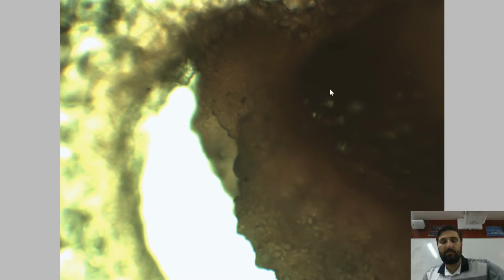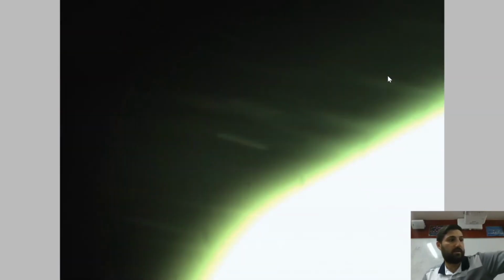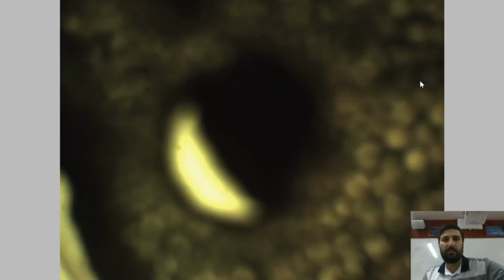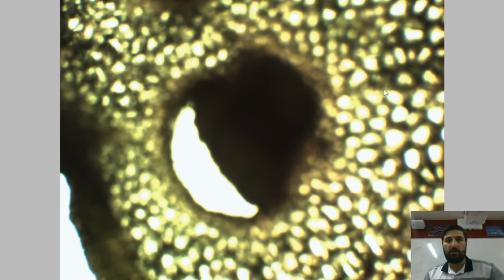Okay, so I'm not really that concerned about looking at it like this for this prac.